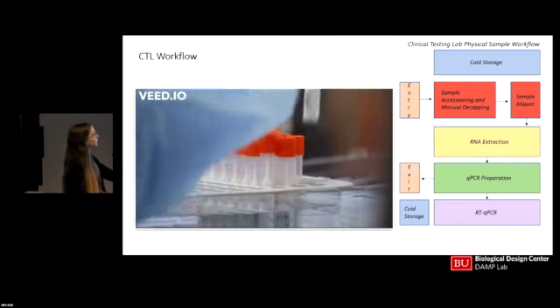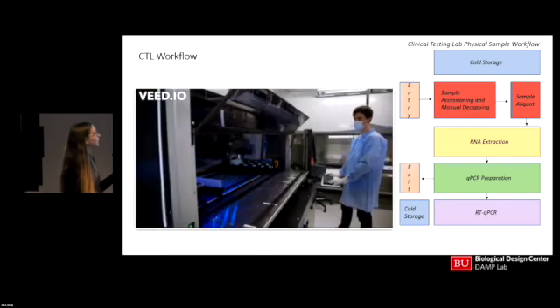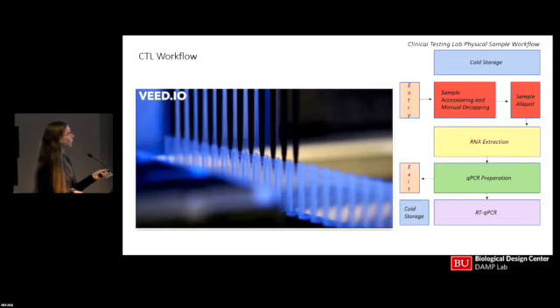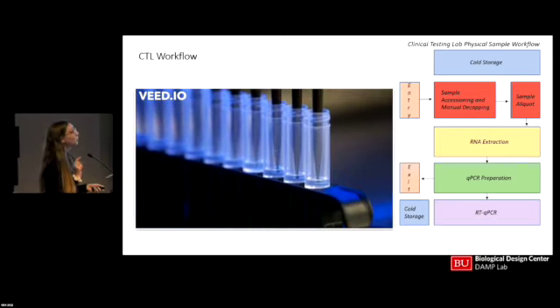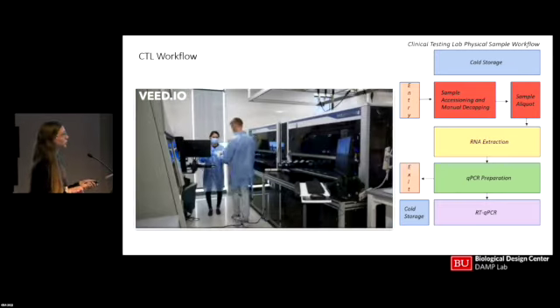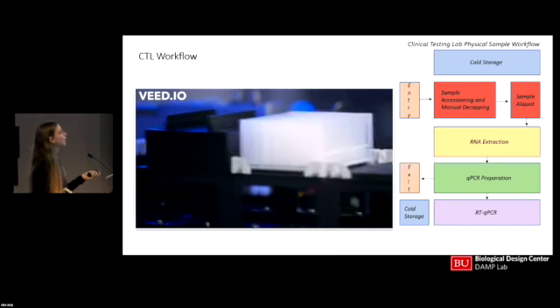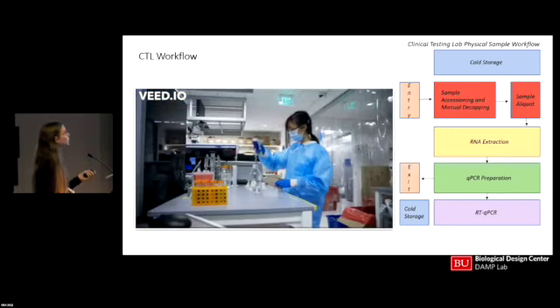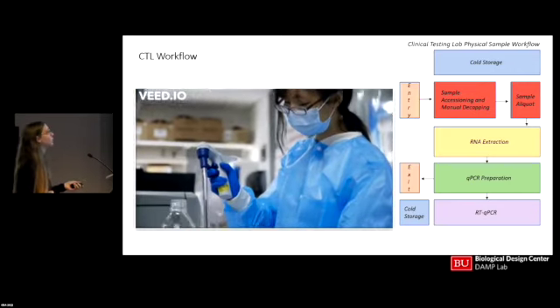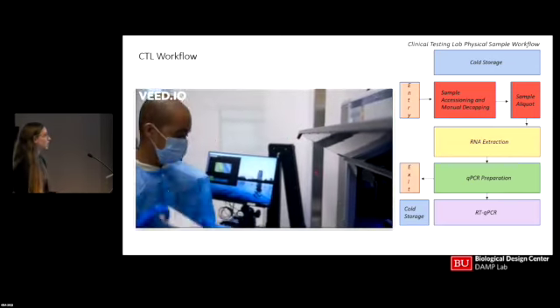So this over here is just a workflow of how the lab was designed. So samples would come in, they would be accessioned and decapped. So this would be where all the inactivation would happen. And then this is the sample aliquoting robot, which is right here. We had 1 sample aliquoting robot, and then they would move to RNA extraction where there were 3 Hamilton robots that would perform the RNA extraction. And then we had 3 additional qPCR Hamilton liquid handlers that would perform the qPCR prep, and then the 5 QuantStudios that would perform RT-qPCR, and then we would do data analysis with that.